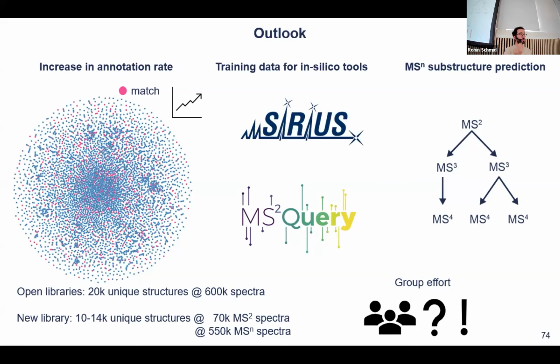I know that for SIRIUS, for example, they don't really look at the intensities. They very much say we need as much information as we can get. So more signals is more important than having exactly the same intensities. Yeah, so more signals, more information. So increasing the fragmentation energy and having multiple ones merged is maybe better.